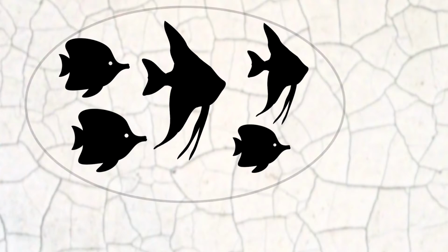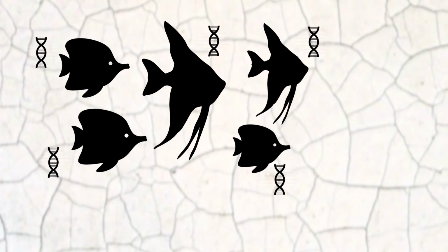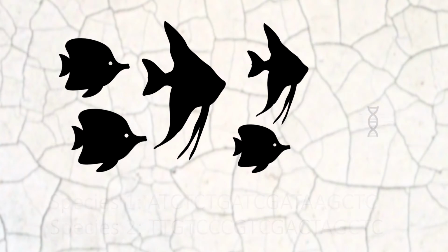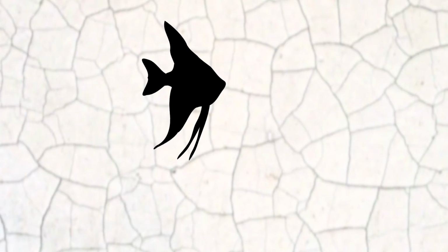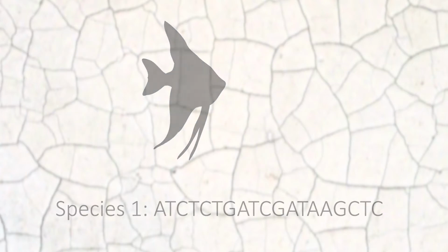When using high-throughput methods such as Illumina-MiSeq sequencing, numerous species can be sequenced simultaneously. Therefore, DNA can either be extracted from a mixed culture and sequenced, or DNA from various species can be pooled prior to sequencing. For Sanger sequencing, however, it is imperative that a pure species is obtained, because Sanger sequencing cannot distinguish between 2 or more different DNA sequences.